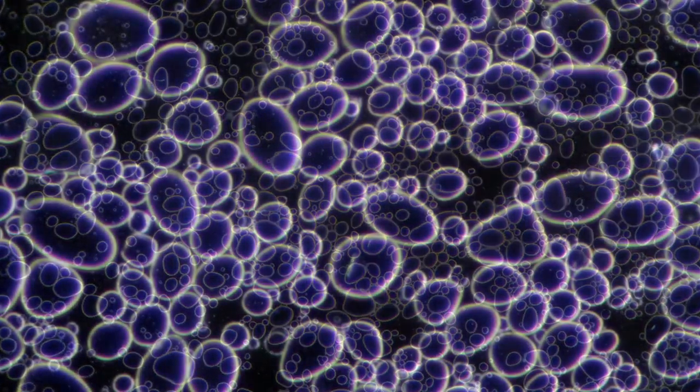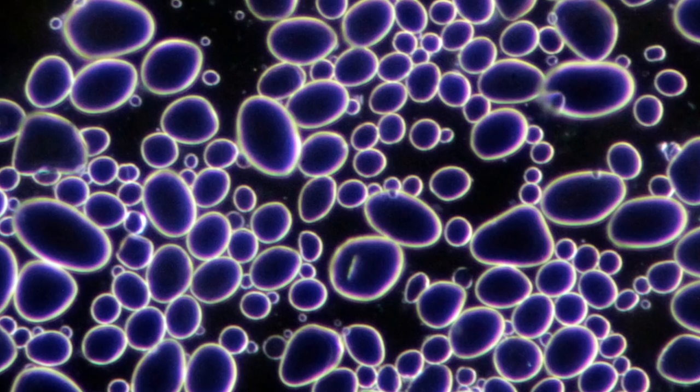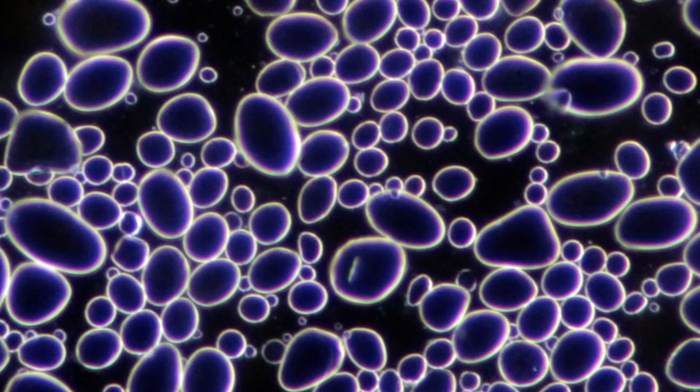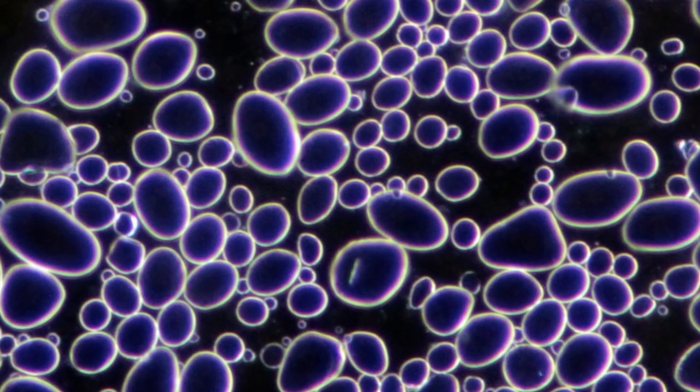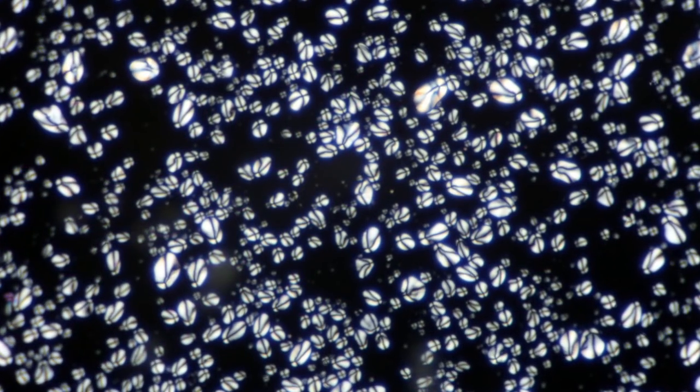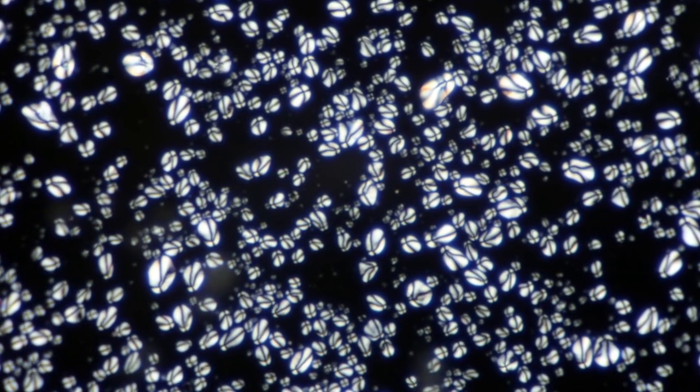That's basically a simple static image that I now took. Here they are again in dark field and now again polarized light.